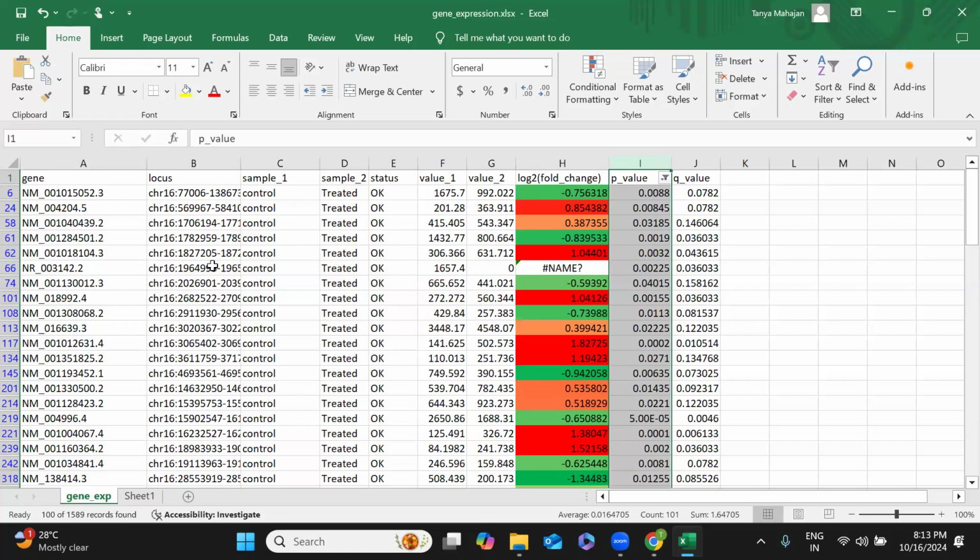Shall we move forward, Priyadarshini? Ma'am, where to go and change sort and filter? Which filter? Did you provide a filter to log fold change? Yeah. Then after I have selected the p-value, open the sort and filter. Yeah, sort and filter. Then go to number and filter.